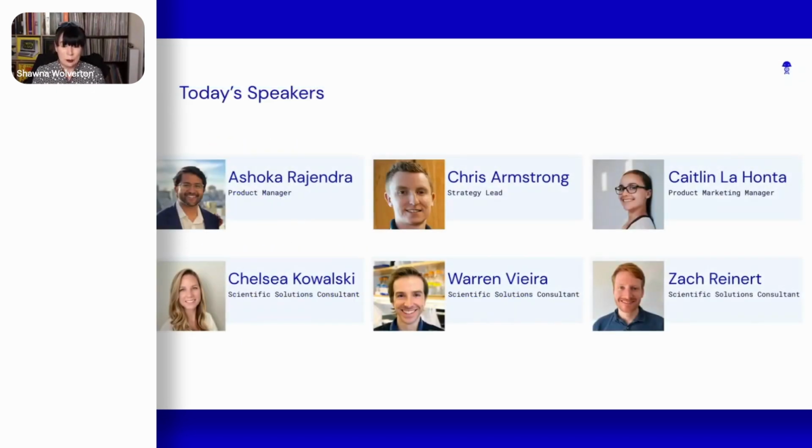So with that, we have a great lineup today of speakers from across our organization, experts in product and solutions and customer experience. And actually, let's just dive in on our first topic, which is biology's modern LIMS.